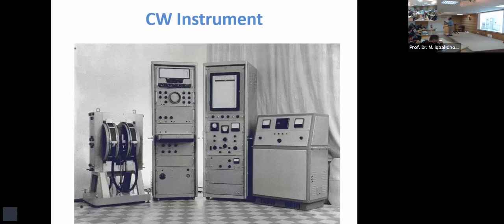So when a tiny little magnet like Earth is trying to survive against a big magnet like the sun, that is called orbital mode. This is exactly what happens. The precession frequency is the survival technique of a small little magnet under the influence of a big magnet.